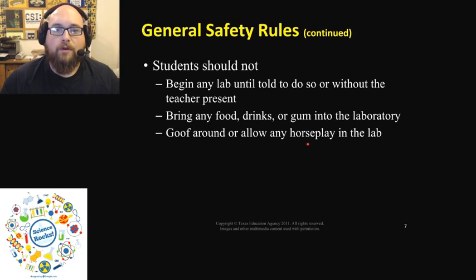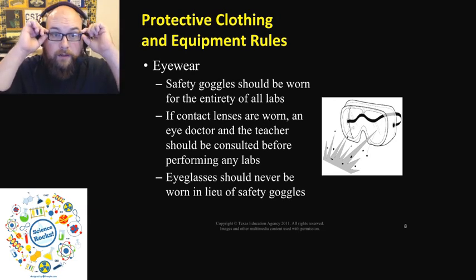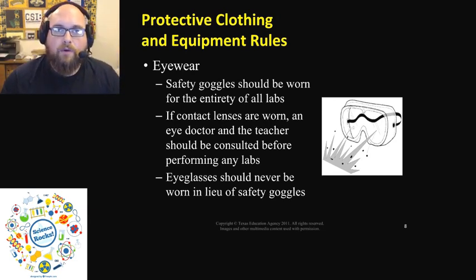So that's very important that you participate in those. Okay, so some of the safety equipment we have, of course, is goggles, or they say eyewear. When you get older, you will see many different types of goggles. The ones we have in class are designed to go over regular glasses. They may be quite warm and might fog on you. That is okay, but we need to keep those on the entire time of the activity.